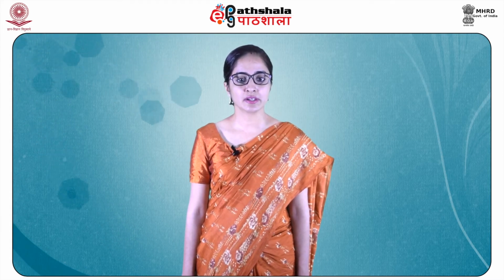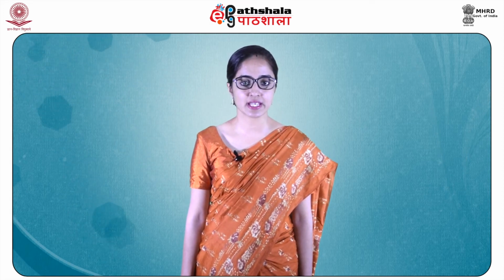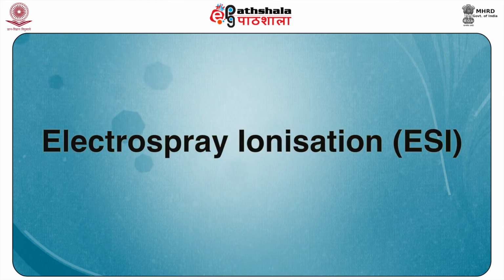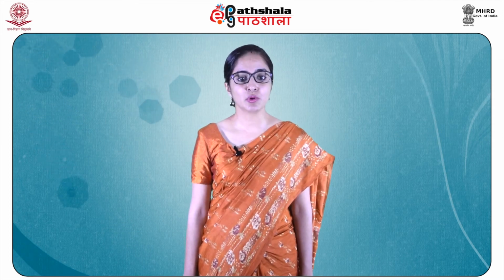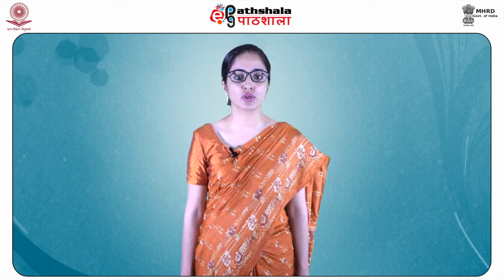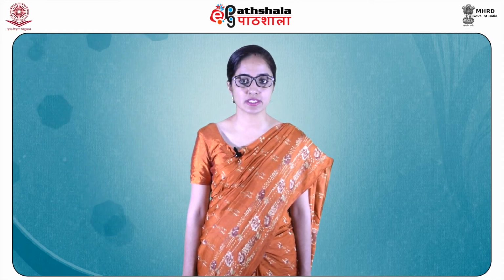Now, you can see here the combined techniques, that is MALDI-SIMS and FAB-MS techniques, as I have compiled them in this figure. Now let us come to the fourth ionization technique, also known as ESI ionization, that is the electrospray ionization technique. An even more useful technique, that is ESI, for studying molecular weight of biomolecules and other labile or non-volatile compounds is electrospray ionization and its cousin technique thermospray ionization.